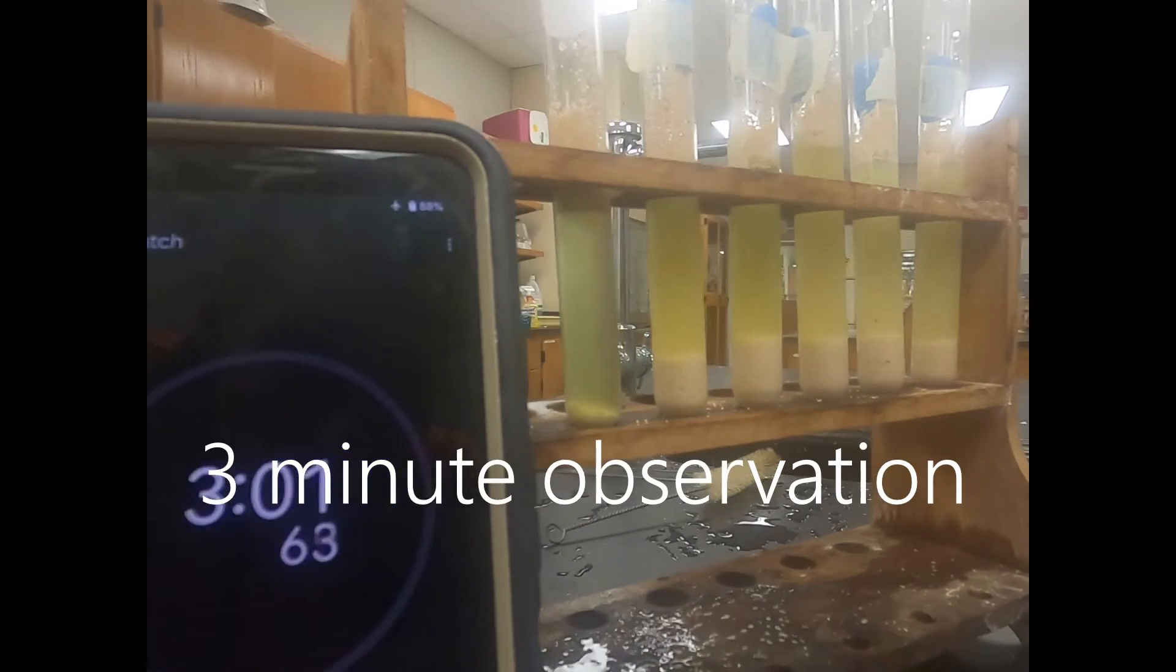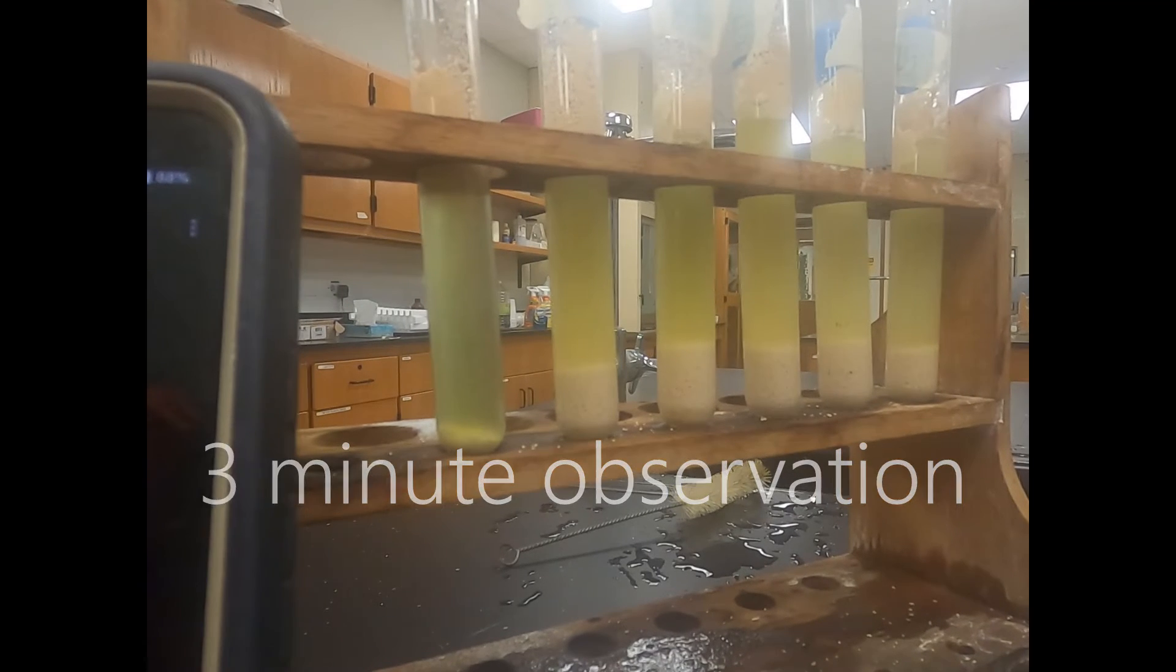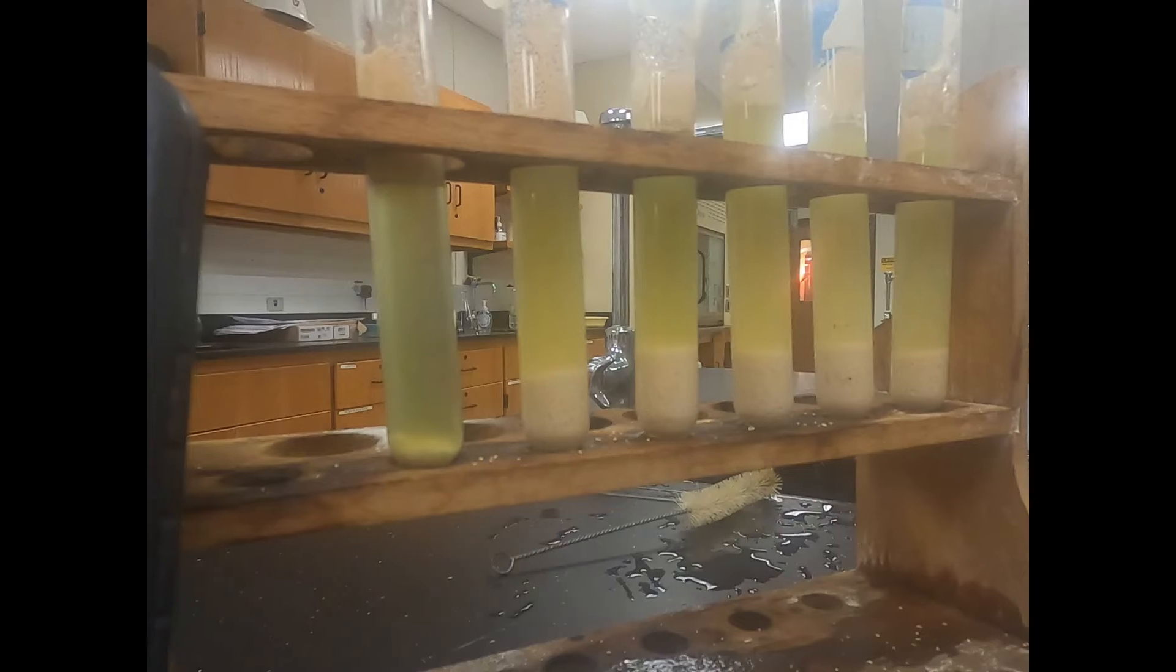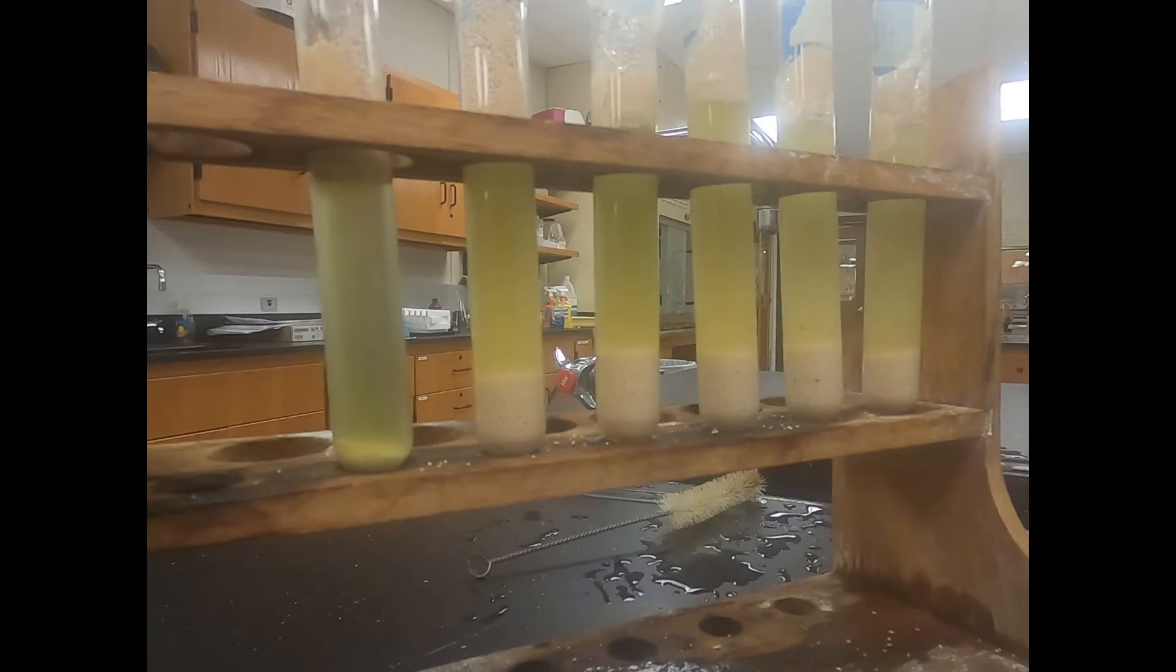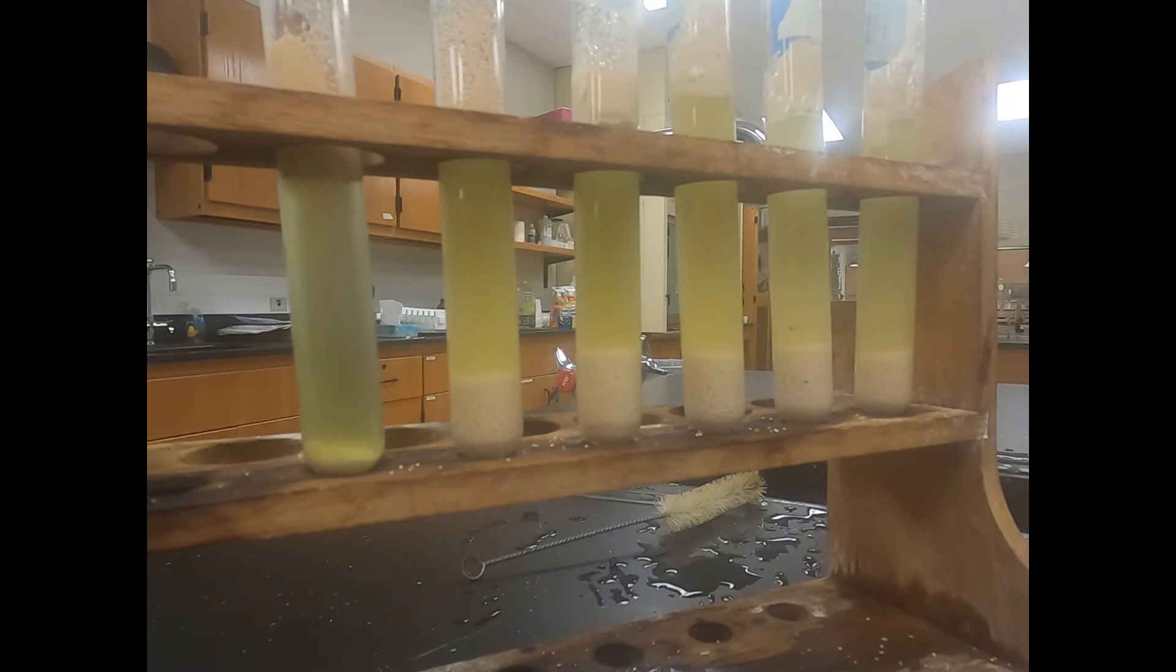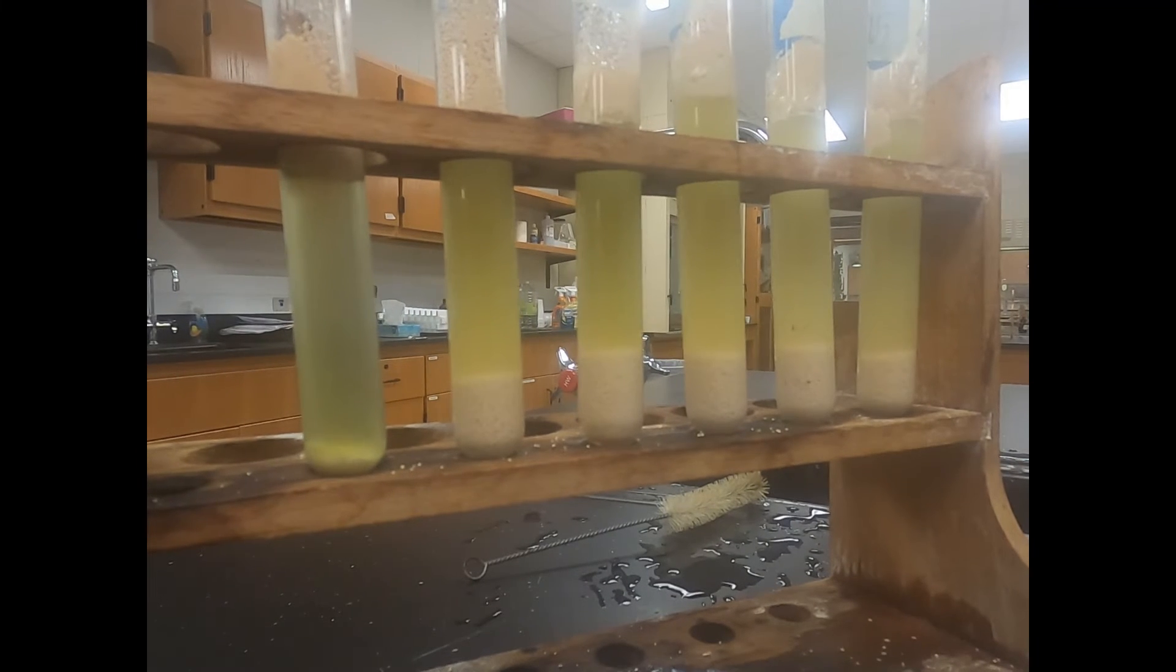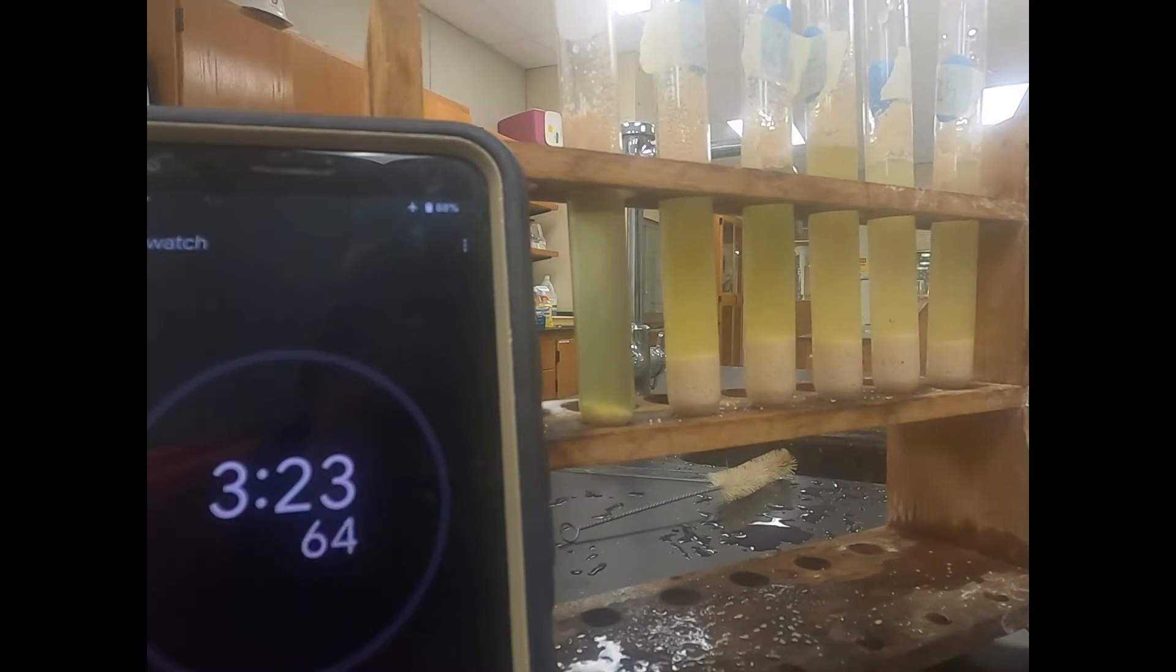So it's been three minutes so we want to look at that coloration. Specifically we're looking at changes in color and how that change may be different between different levels within these test tubes. Again record your color. Make sure you're being specific so we can have a good comparison of each one of the test tubes. We'll let it go for three more minutes and catch it at six minutes.